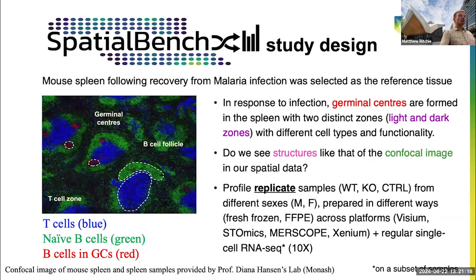The tissue chosen here: typical benchmarking studies up to now are usually focused on brain, but we chose spleen because it was available. And coming from an institute with lots of immunologists, there's a lot of interest in having lots of different immune cells. How do they look in different organs? Spleen is a very rich bag of immune cells.